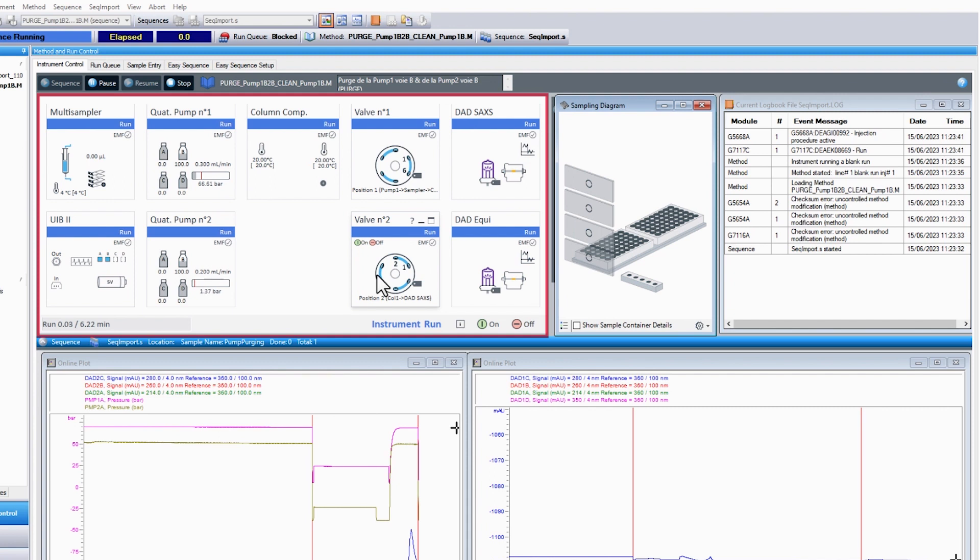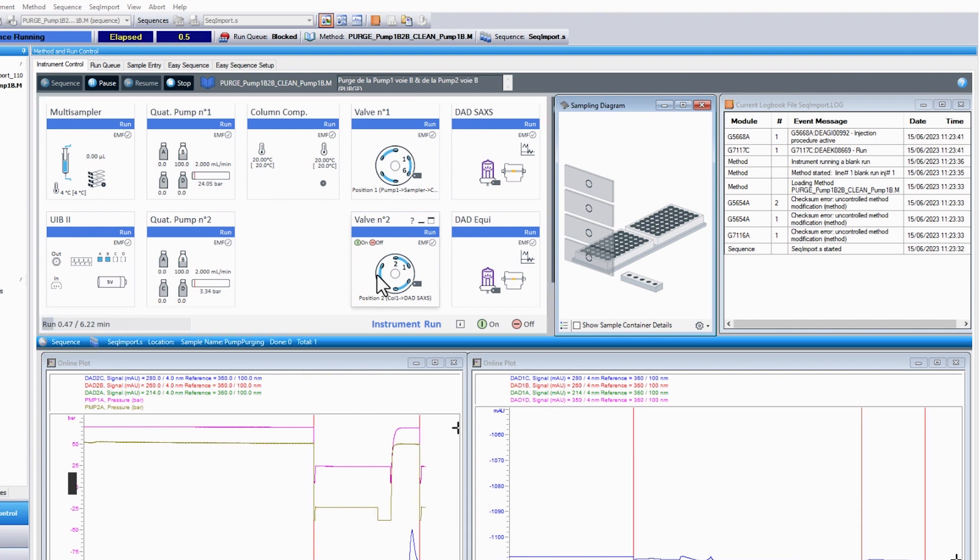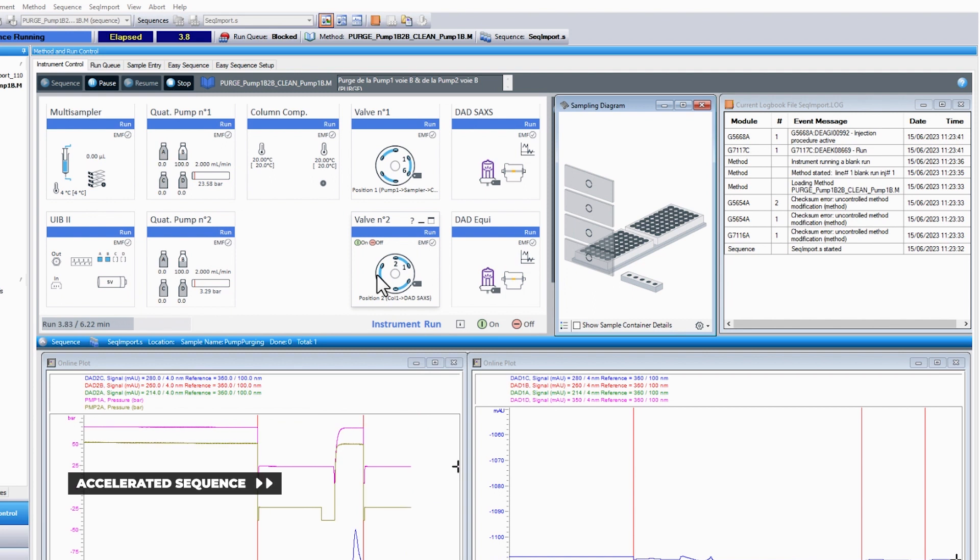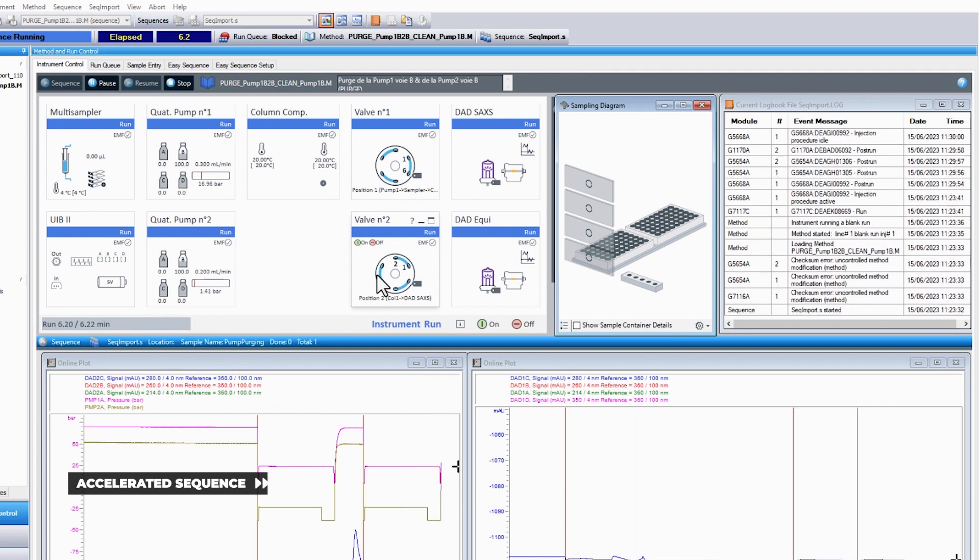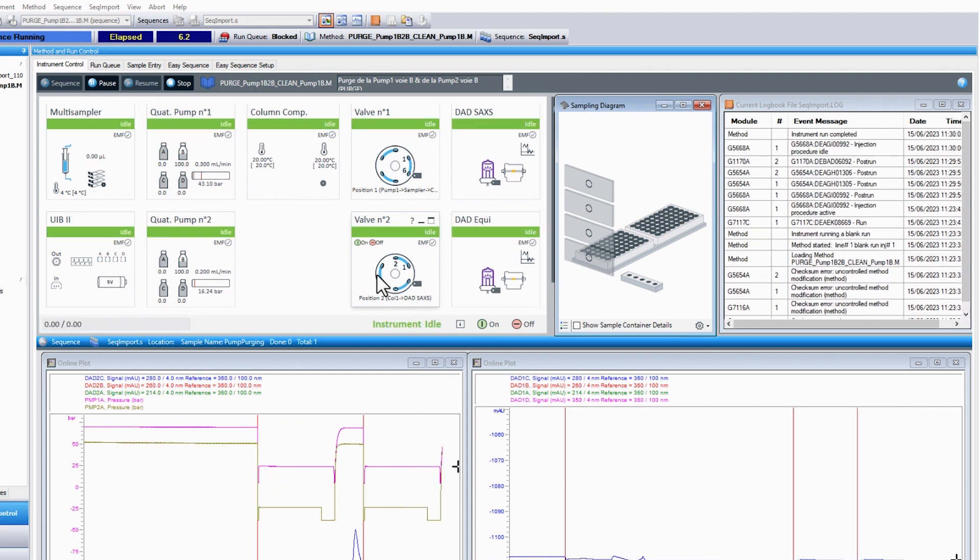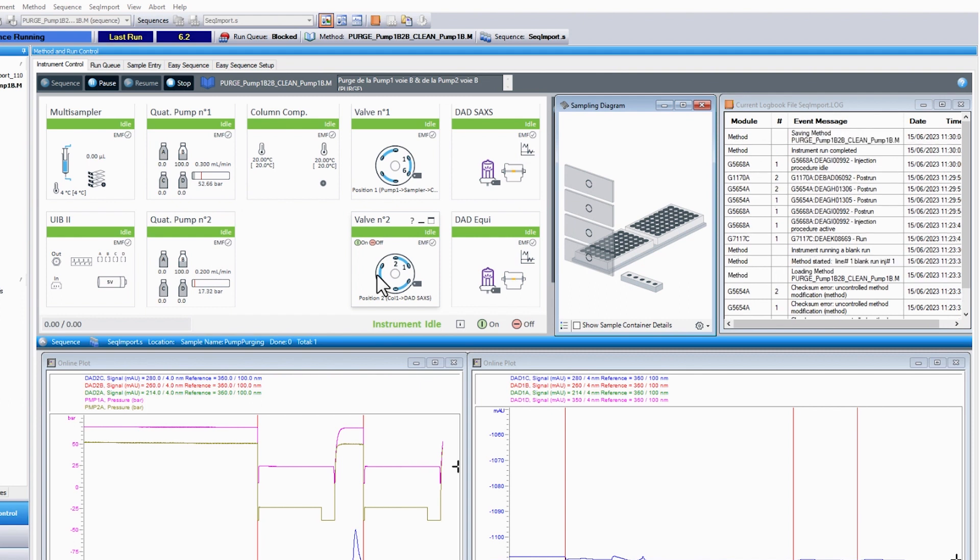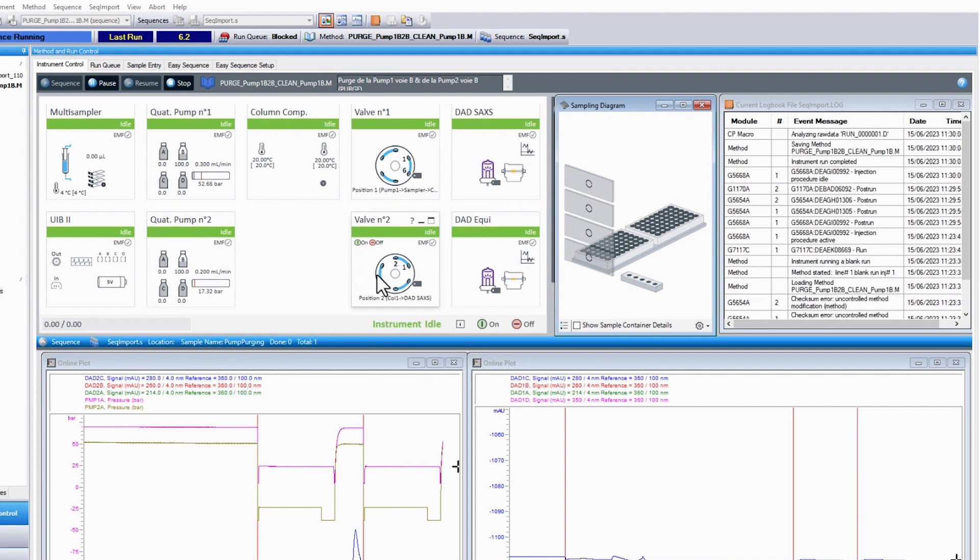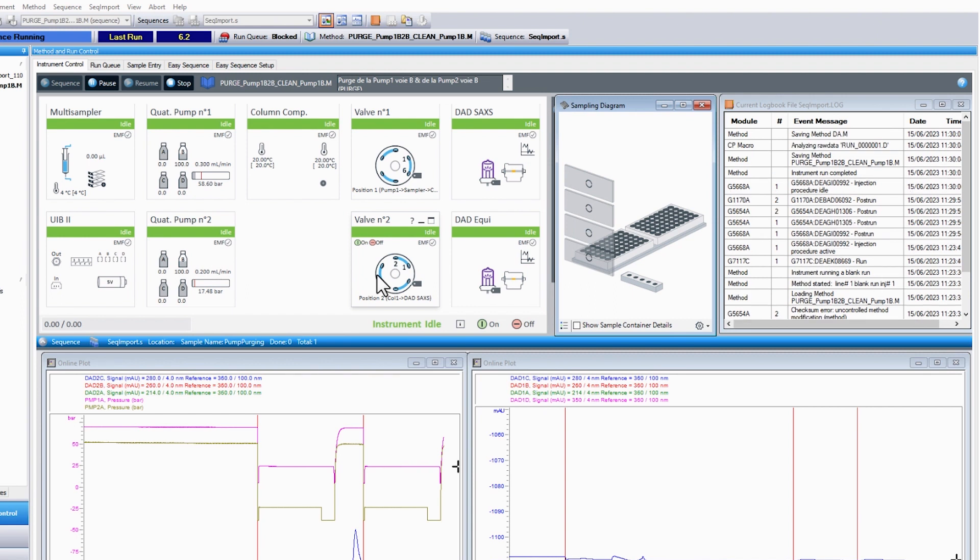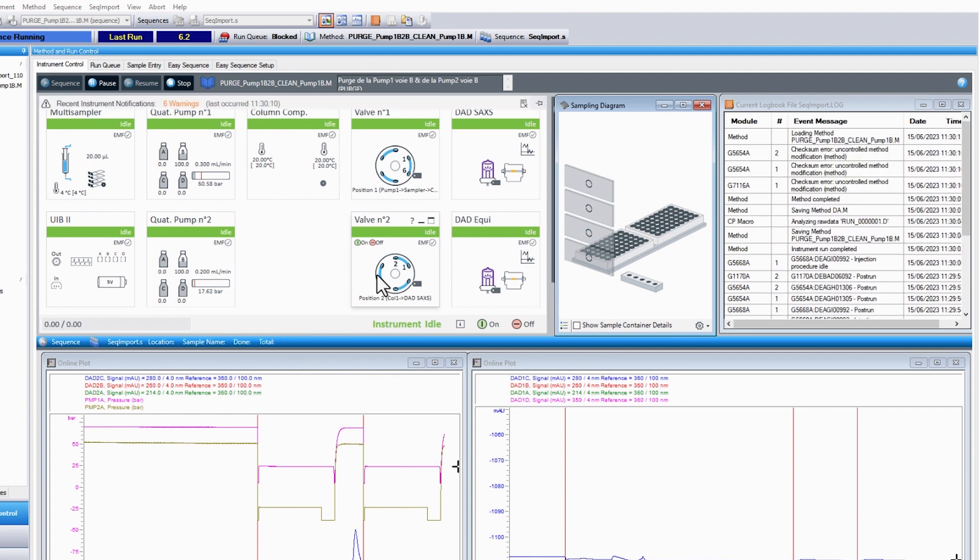When all the rectangles are blue, this means that the purge is running. It takes around six minutes. When the purge is finished, every rectangle goes back to green and the flow rate for each circuit is the one defined previously by execution of the SEC-SAXS setup screen.